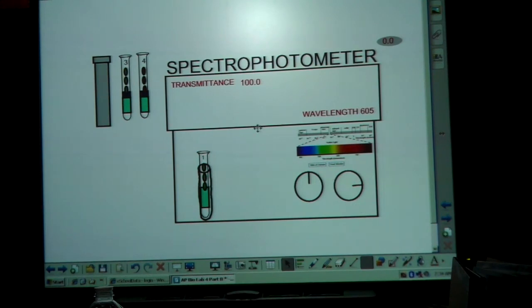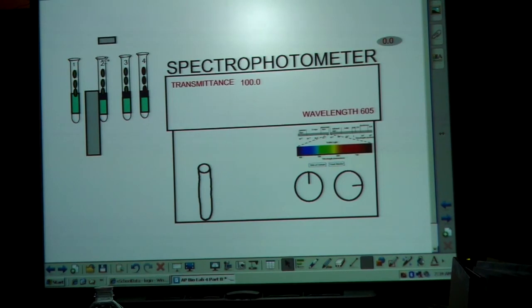And you're then going to set the transmittance to 100. Alright, so using your knobs, you set transmittance to 100. The knobs are very sensitive, so be careful with that. Once that's at 100, you pull number one out, you pull number two out of the foil, and you slide number two in the spot. That's going to give the transmittance, that will give us a new number here in the transmittance spot. And whatever number that is, that's the number you're going to write down on your paper.